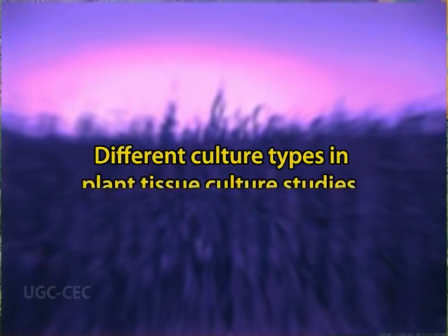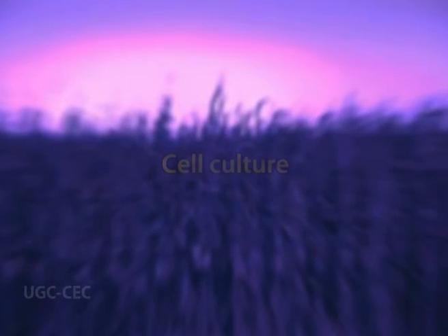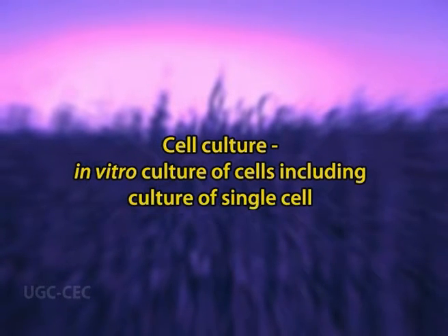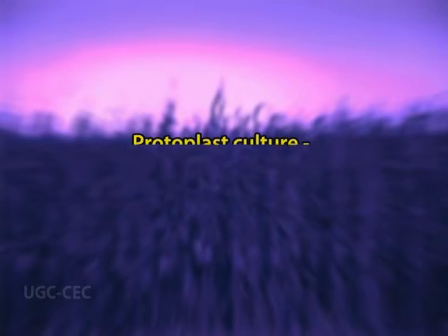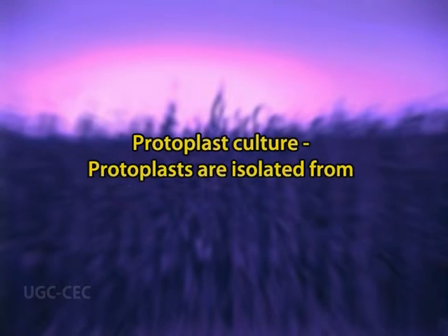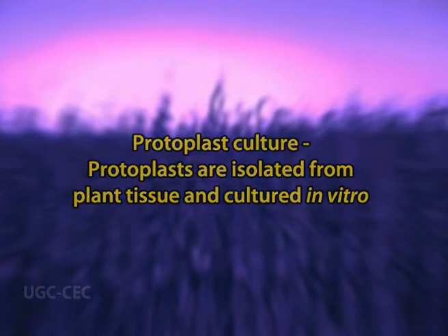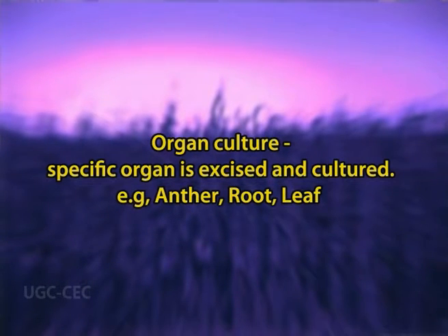Different culture types in plant tissue culture studies are cell culture. It involves in vitro culture of cells, including single cell. Protoplast culture. In protoplast culture, protoplasts are isolated from plant tissue and then cultured in vitro. Organ culture. In organ culture, specific organ like anther, root or leaf is excised and cultured.